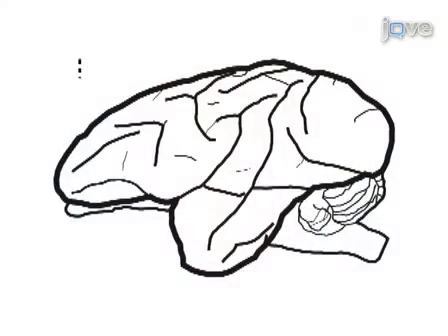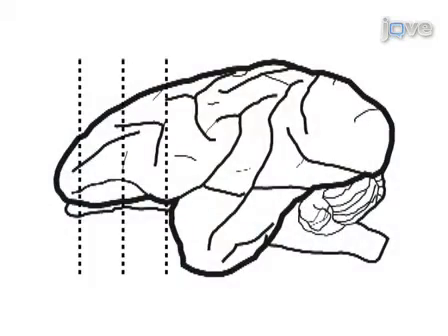In this experiment, we use the frontal lobe of the vervet brain. The series is set to 1 out of 10 sections throughout the cortex and sectioned at 50 micrometers.